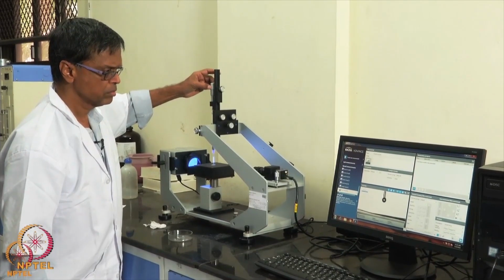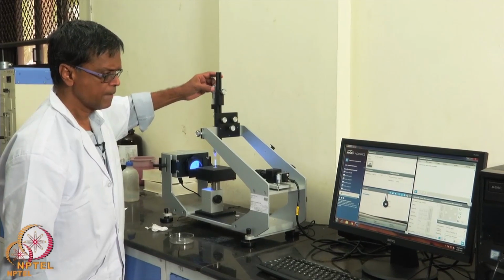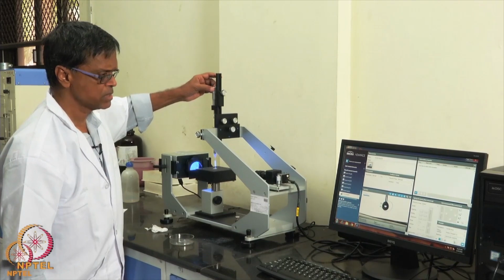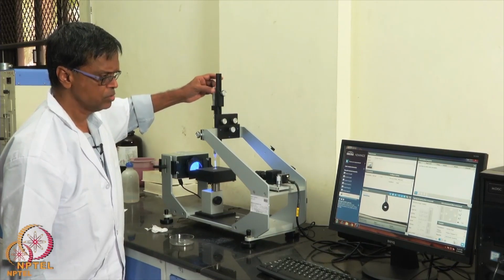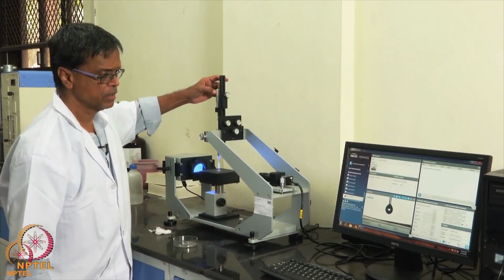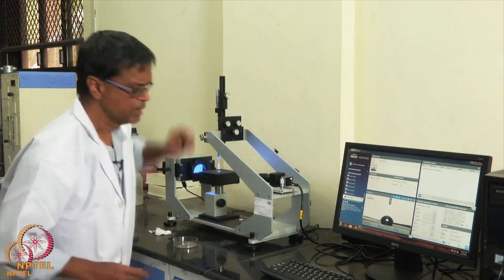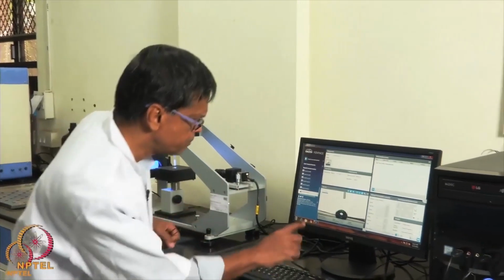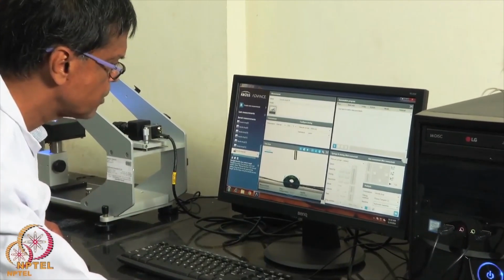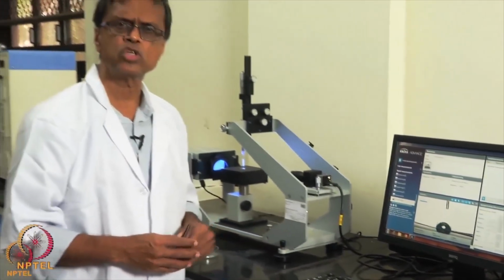As you can follow, as I keep turning the knob clockwise, the drop comes down slowly, so you don't have to let the drop fall and splash. So again you can see the drop makes an angle of around 72-73 degrees with respect to the horizontal.